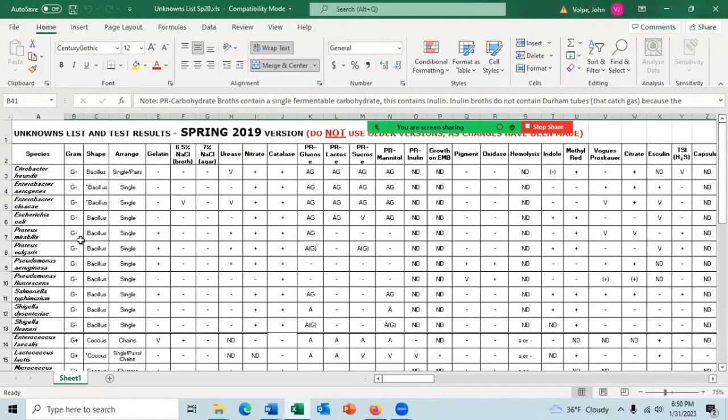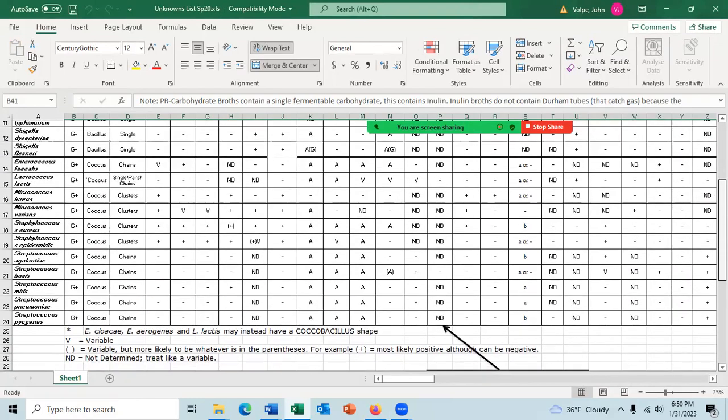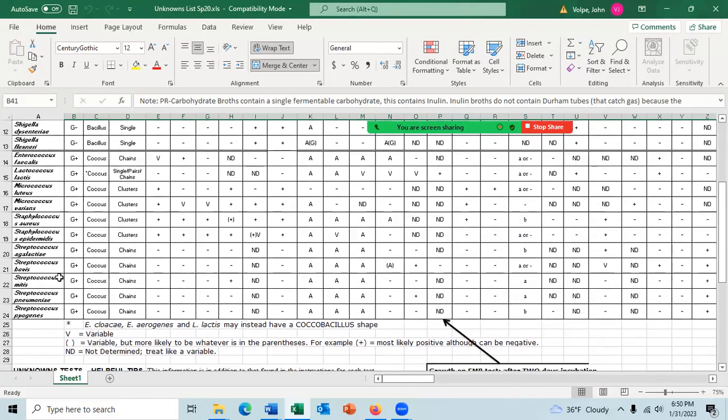So on the left are all of the species under consideration. The top one, there's about 13 of them, are gram-negative bacilli. And then the bottom, about 13 of them are gram-positive cocci. So these are all the species under consideration.